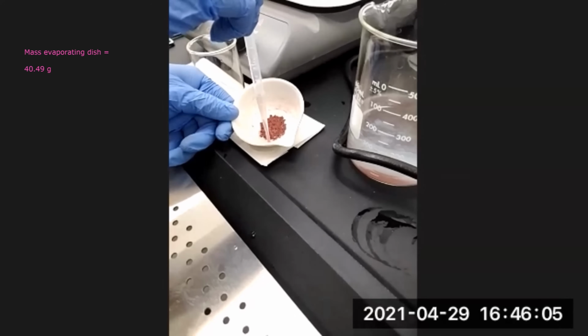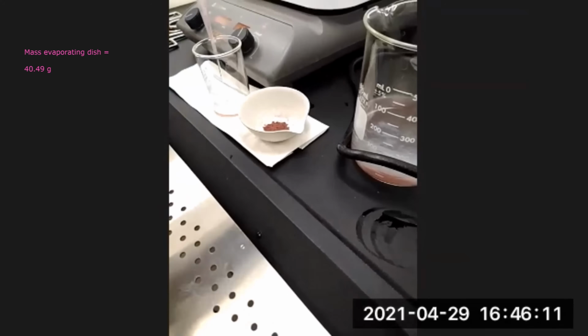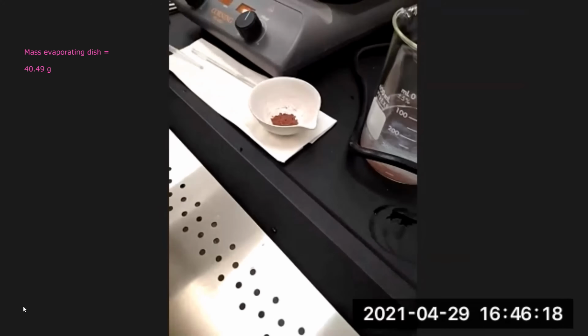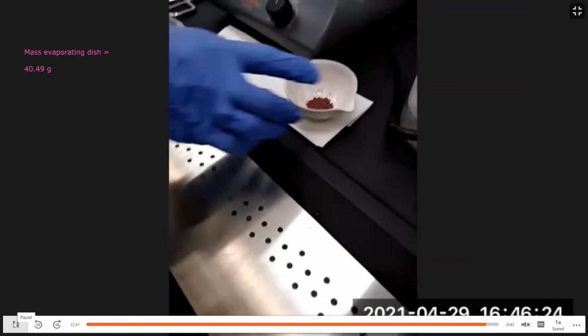So again, before this step, we were washing with water, not the methanol or acetone, because the methanol and acetone, they go in a separate waste container because they're organic solvents. So you do a few washings with the acetone or methanol.